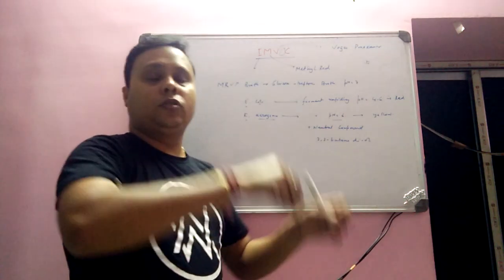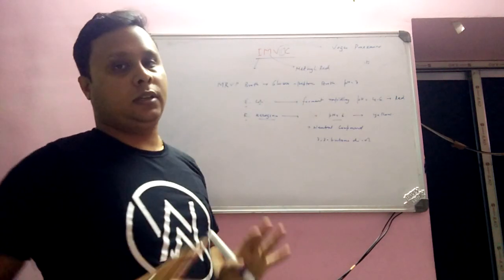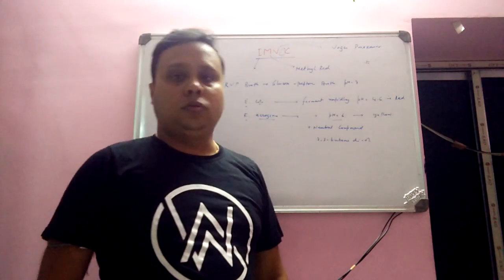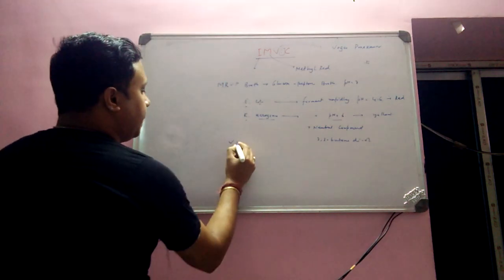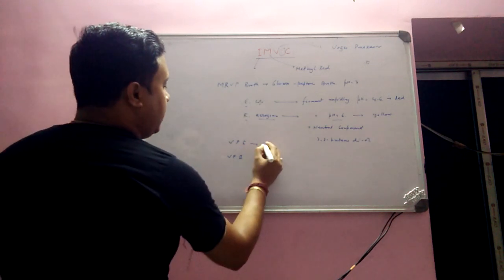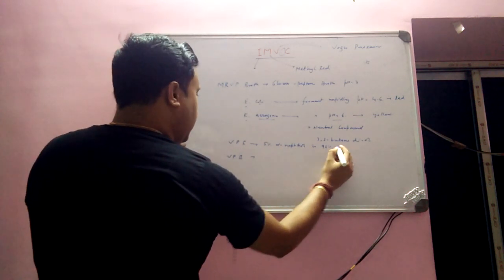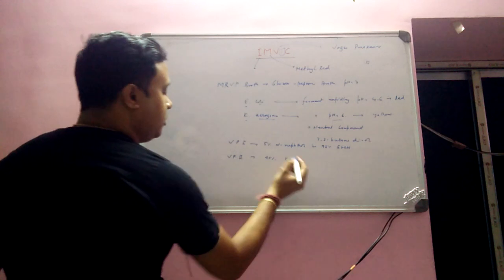After 24 hours of incubation, what you have to do is add 2 or 3 drops of methyl red into it to check whether it appears yellow or red. And for the VP test, we have to use Barritt's reagent, which consists of 2 agents called VP1 and VP2. VP1 is composed of 5% alpha naphthol in 95% ethanol, and VP2 is 40% KOH, potassium hydroxide.